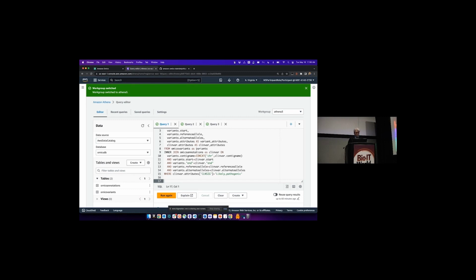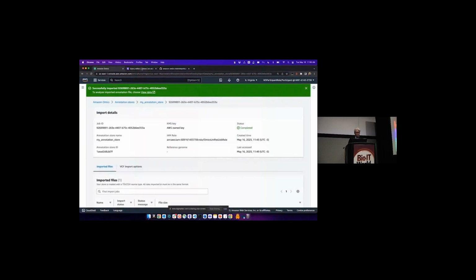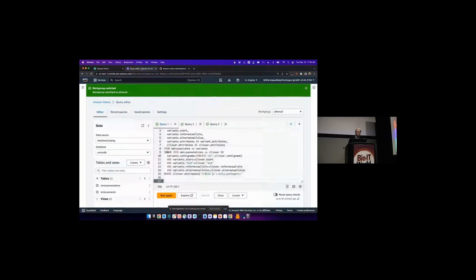If none of those other options work, where you can't express it in a SQL arithmetic operation, or you can't extract it using the parsing tools that SQL offers, you can at least subdivide a larger data set into a chunk that roughly contains the information you're looking for, and then download it and process it using your own tooling.